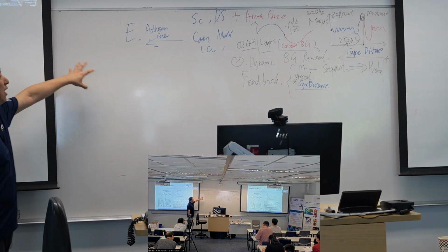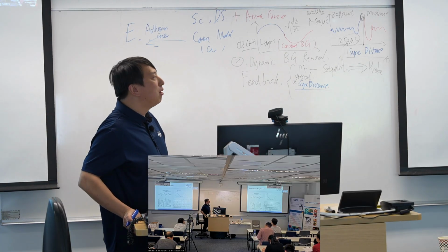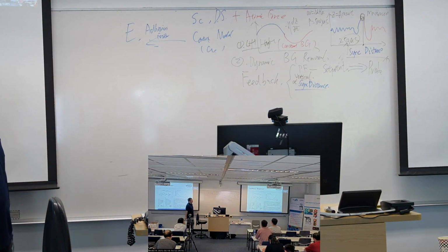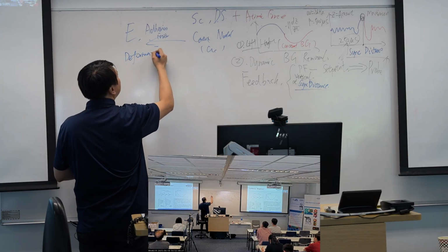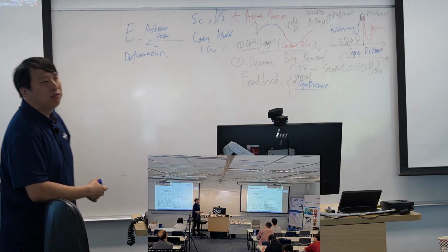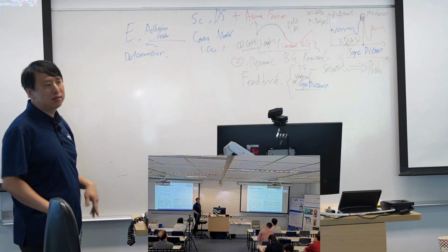And with that, it can give the mechanical property mapping. In the Bruker software, it can give you many different property mappings. For example, the deformation mapping. But the deformation is not meaningful to us because we have modulus. We don't need the other stuff.